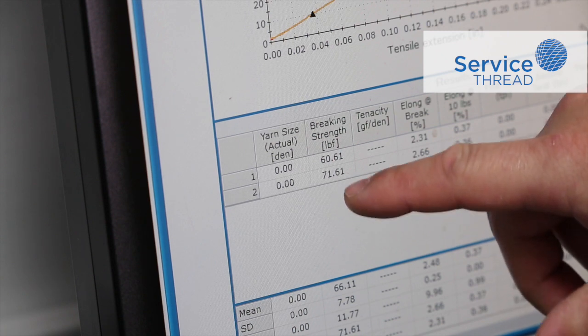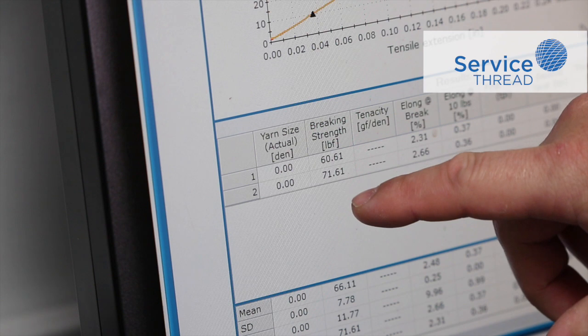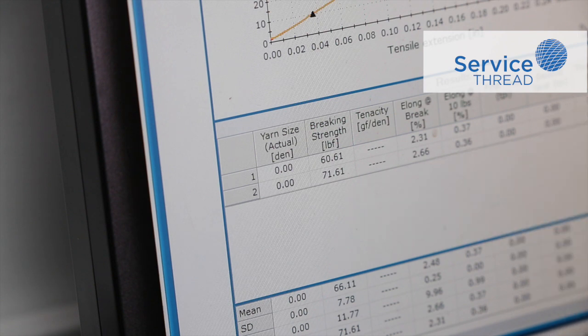The twisted yarn is a much more accurate representation of what the actual breaking strength of the material is, because the fibers broke as a bundle.